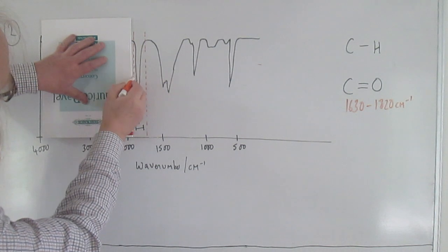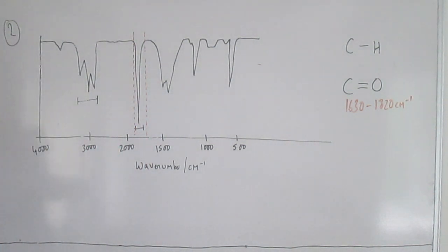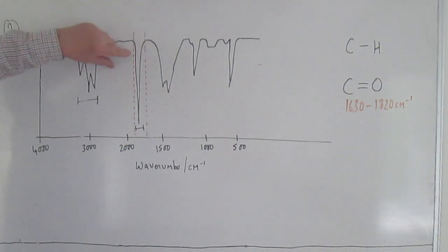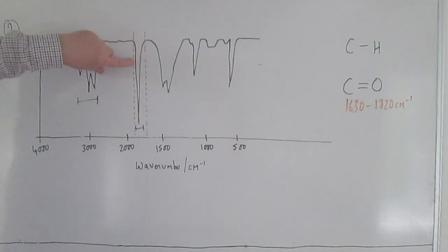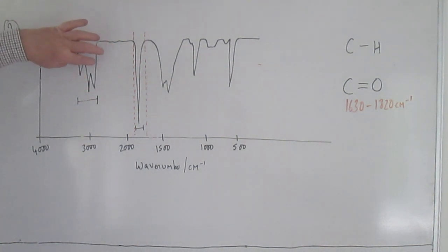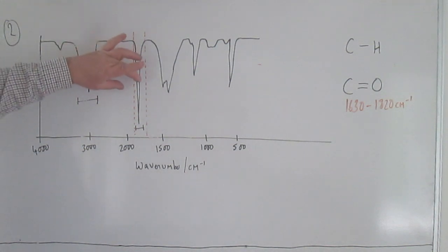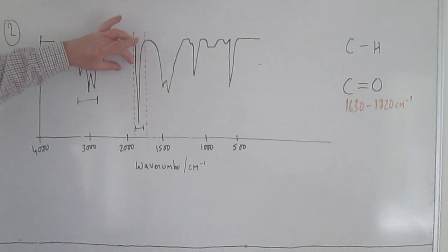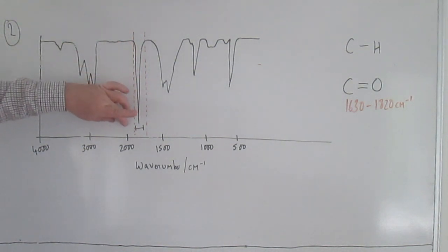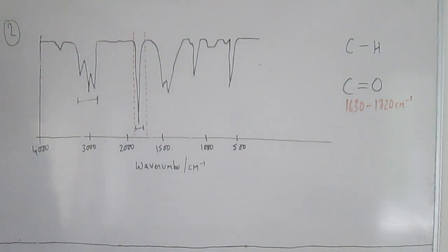And then you draw that line down there, and it should approximately bracket the peak like that. It may clip the peak somewhere down towards the bottom, and some peaks like the CHs tend to wander around a little bit, so they won't always be contained within that envelope. But if the tip of your peak is actually outside that envelope, then you think that really doesn't look like C double bond O.